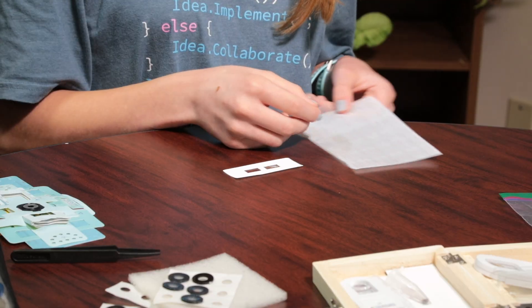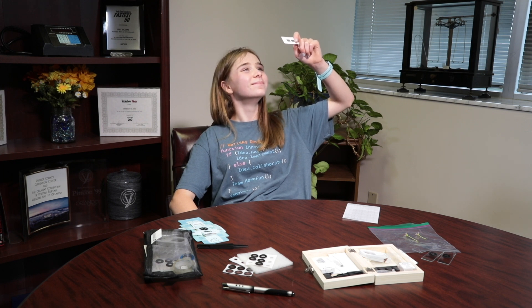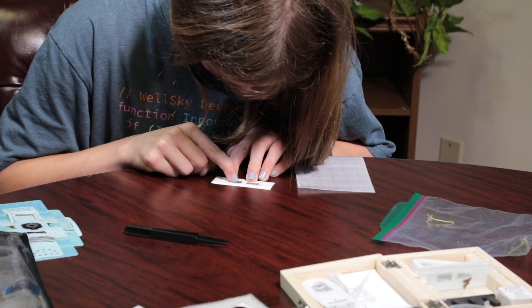Use a paper slide and clear tape or stickers to secure your solid sample. Hint: make sure all solid samples are translucent, or you can thin it out with tweezers to make it so.